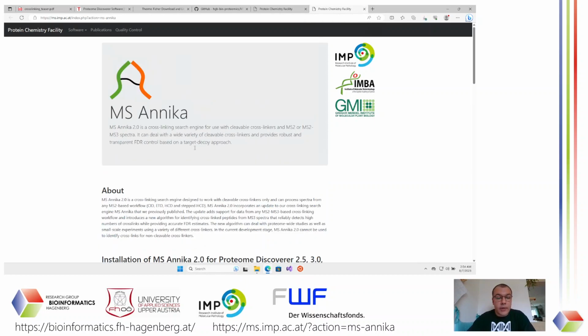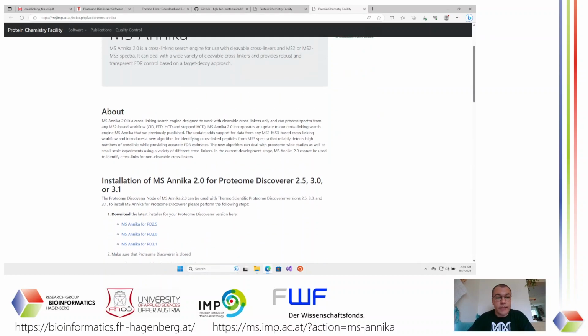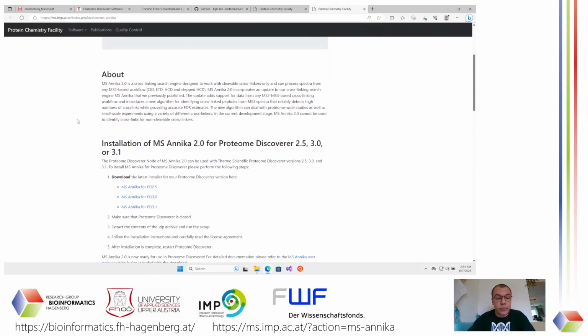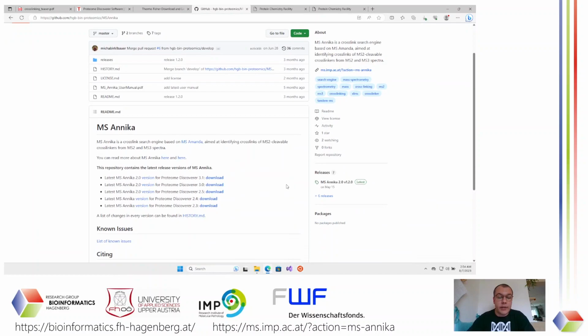So for MS Annika, you can either go to this IMP website, where you can download MS Annika for PD 3.0, which is the version that we are going to use, or you can also go to our GitHub page, which is github.com/hgb-bin-proteomics/MS Annika, where you can also find the newest version of MS Annika.